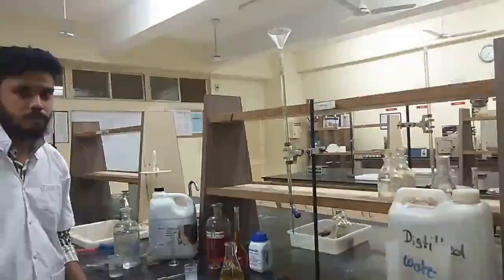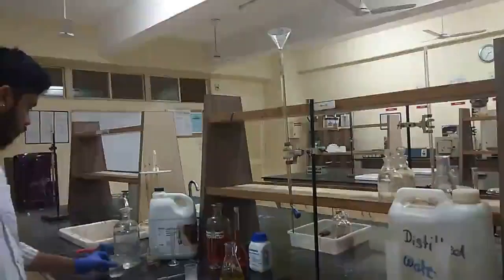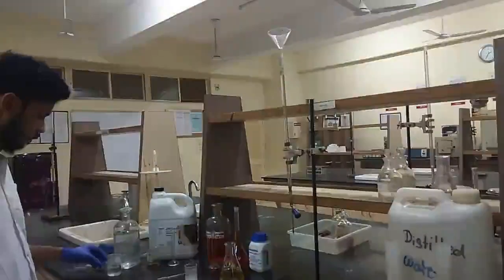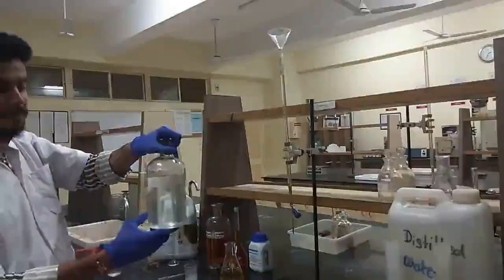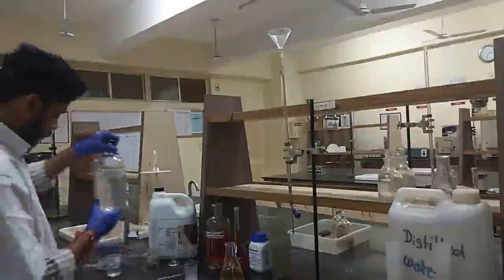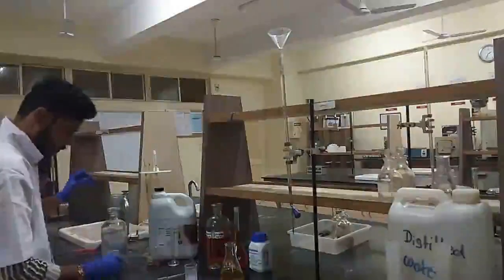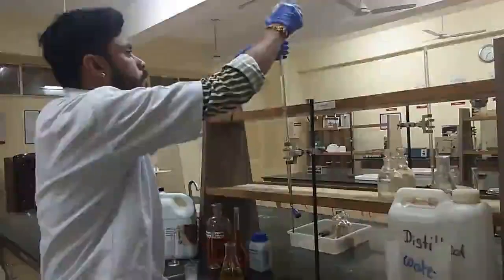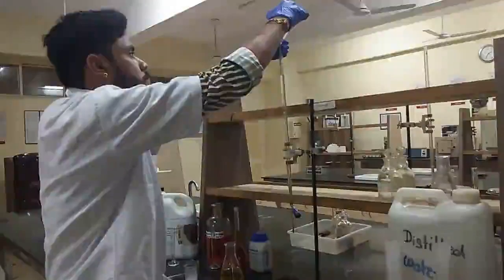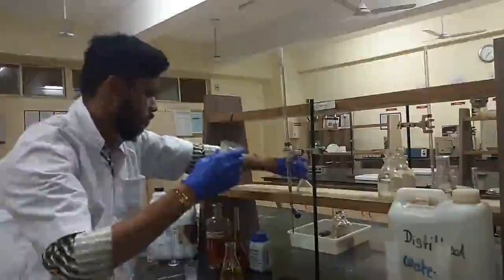Till that time, we are going to add a titrant in our burette. So wash the burette properly, and the titrant that we are going to add in our burette is 0.025 normal sodium thiosulfate, of which the normality is to be determined. So we are going to fill this burette completely. We have already washed it, and we are going to fill it, and then we are going to adjust it to the 0 mark.